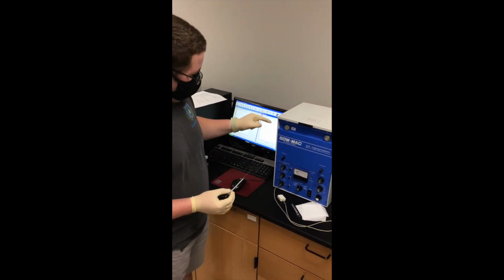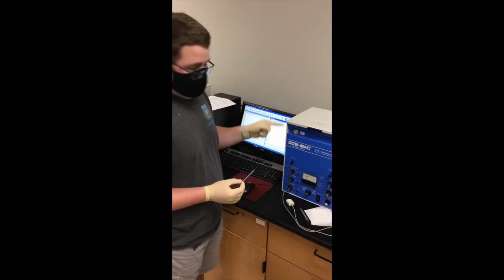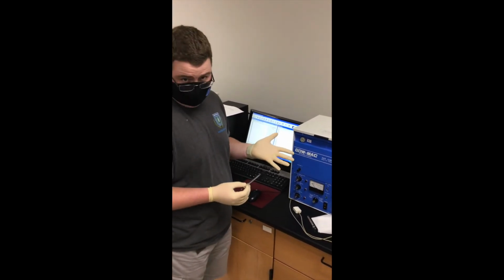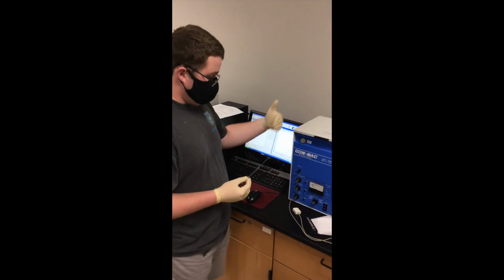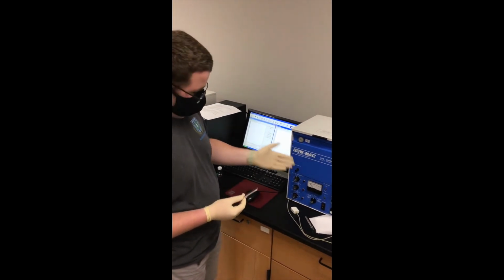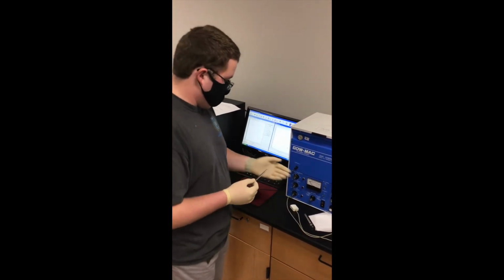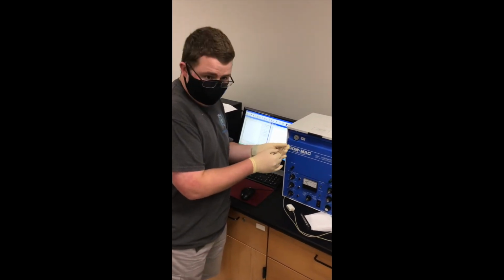When this is actually activated, this right here is where you're going to be injecting your fluids into, and this is a piece of metal. Now, gas chromatographs are heating up the stuff to the boiling point, so they're extremely hot on the inside, and since this is metal, it's conductive on the outside too, at least thermally conductive. So this will be very, very hot. It will be as hot as it is on the inside, whatever the detector temp is set to. So I need to put this in here without burning my fingers.